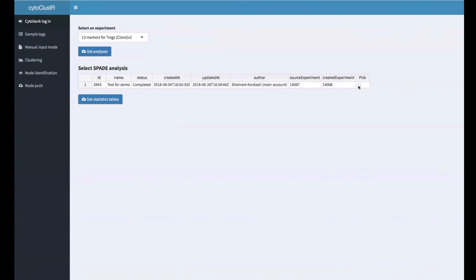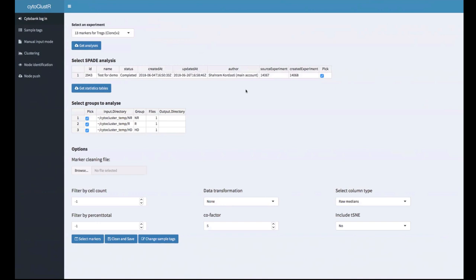Here we have one SPADE analysis and we select it by clicking the large box. By pressing 'get statistics tables,' Cytocluster contacts Cytobank and retrieves, downloads, and unzips all the files from Cytobank for this particular SPADE run. It retrieves the three groups — one file per patient for each group. We pick all three to analyze them and compare across different conditions.